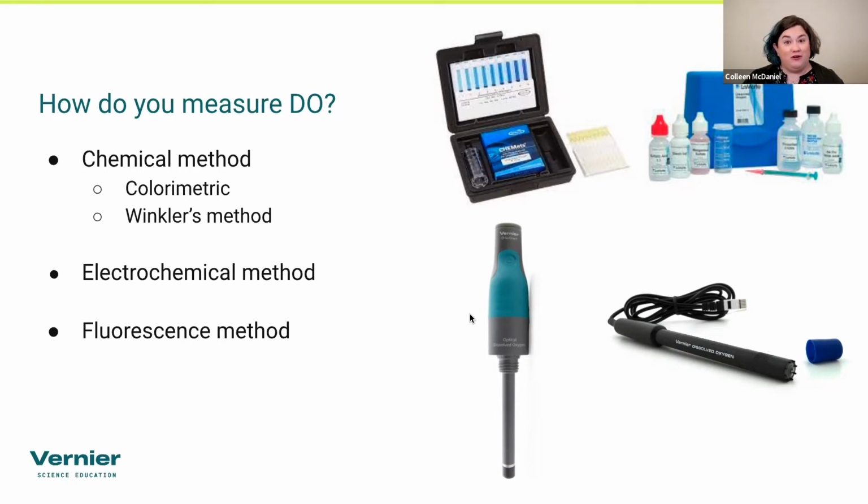Then we go to our fluorescence method. This is what we consider the newest and greatest technology that has come out for dissolved oxygen readings. It's been around for about 20 years now, but has only been really accessible to the consumer market for about 10 years.